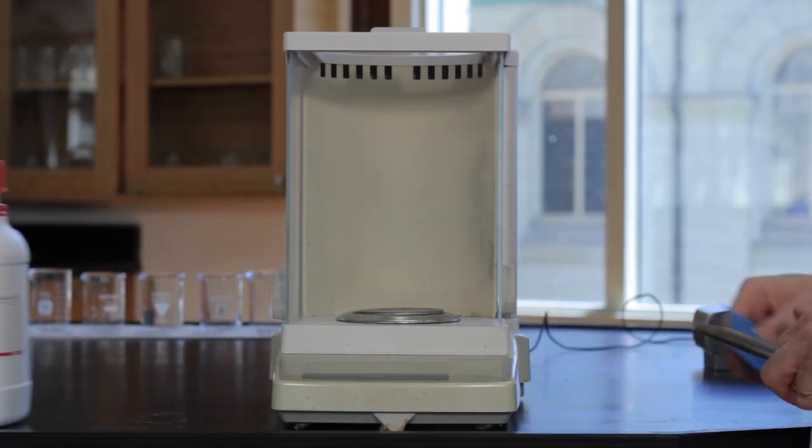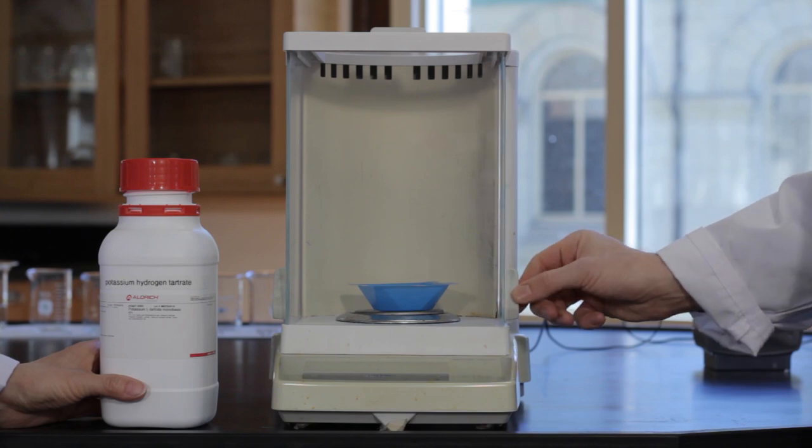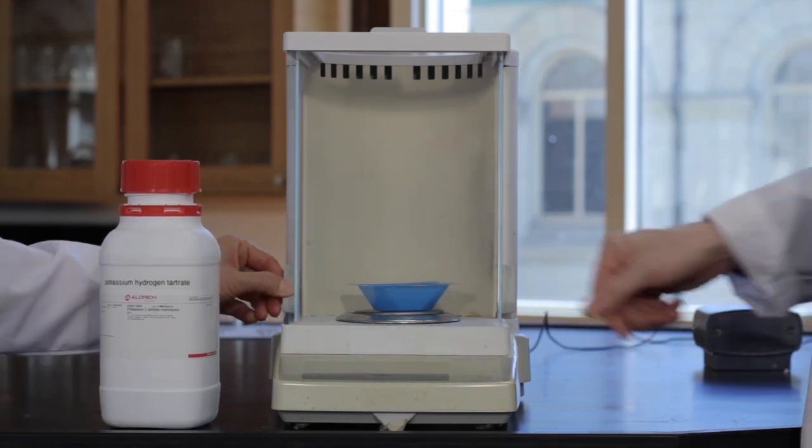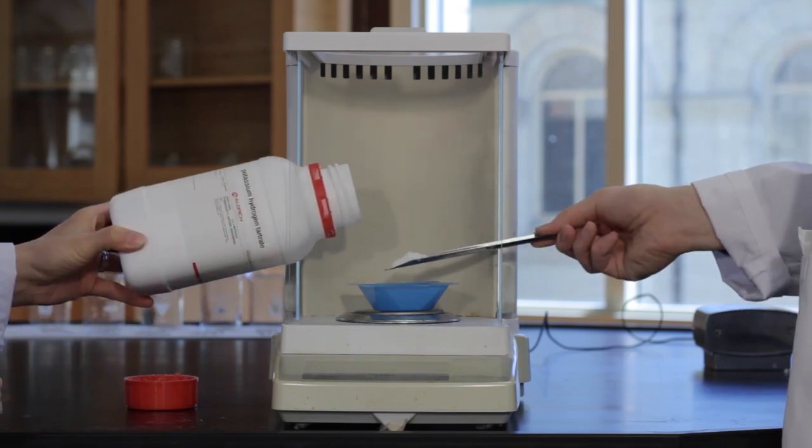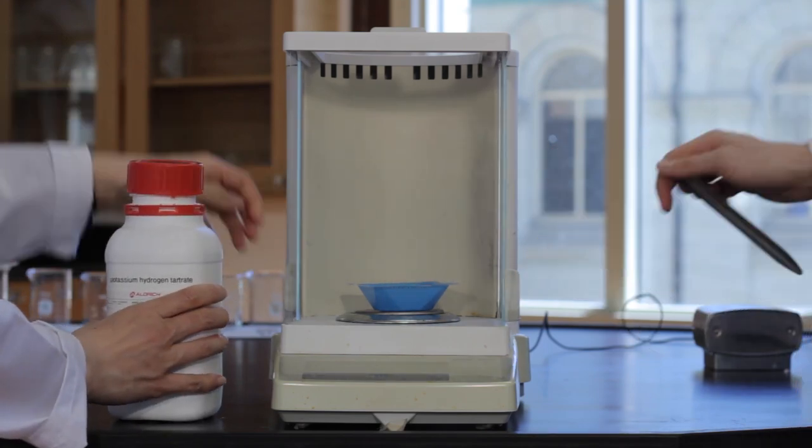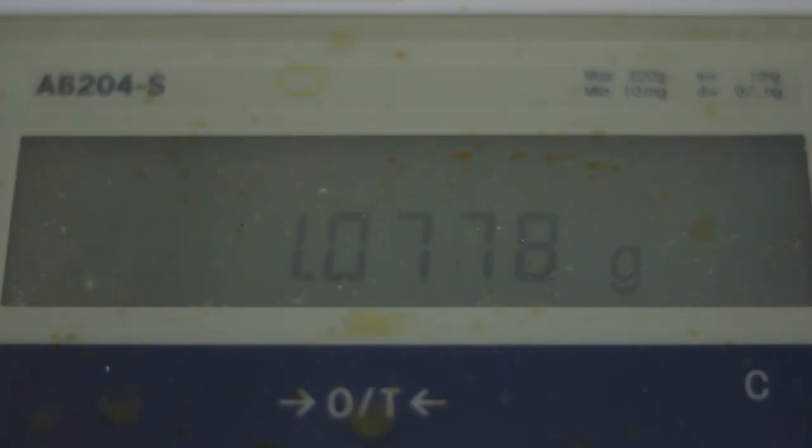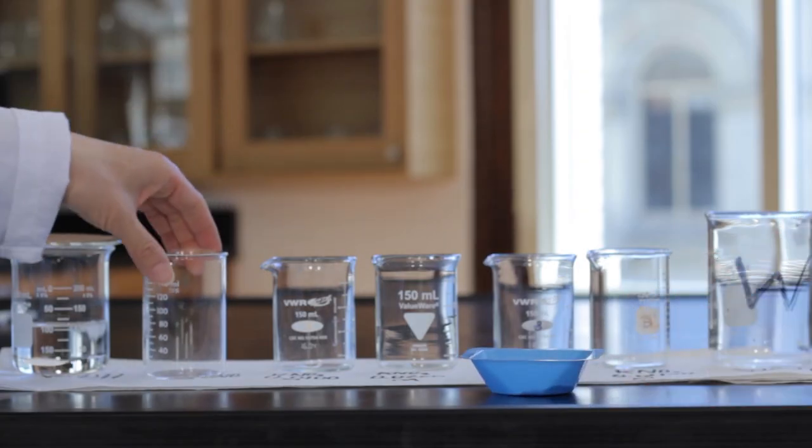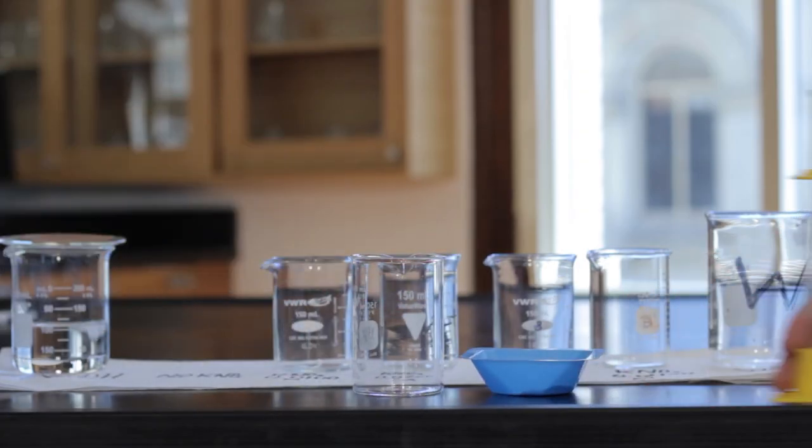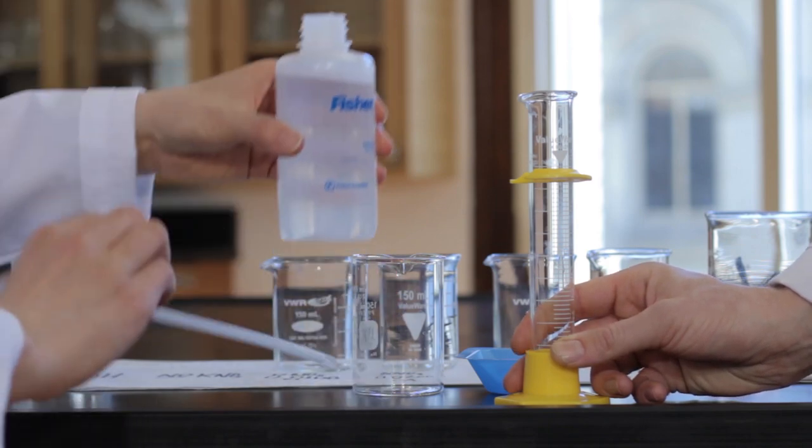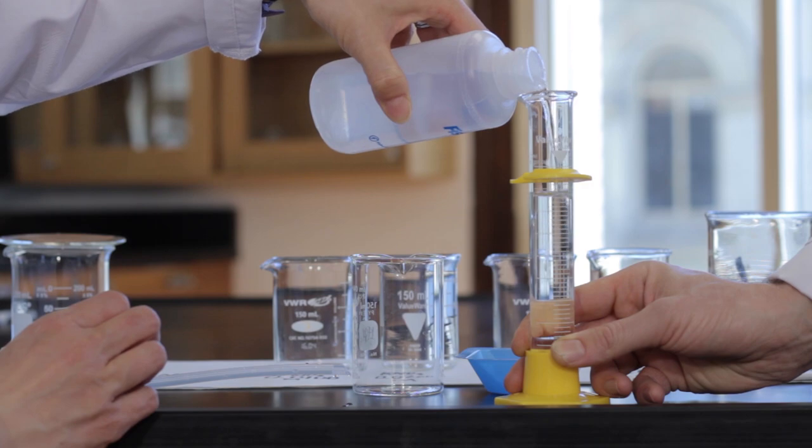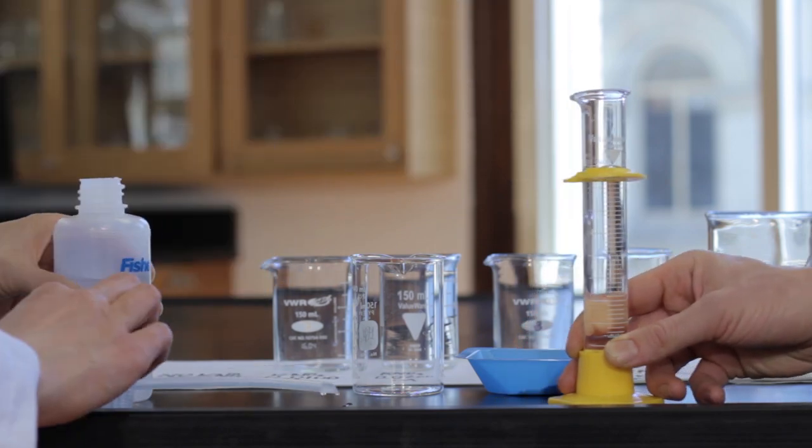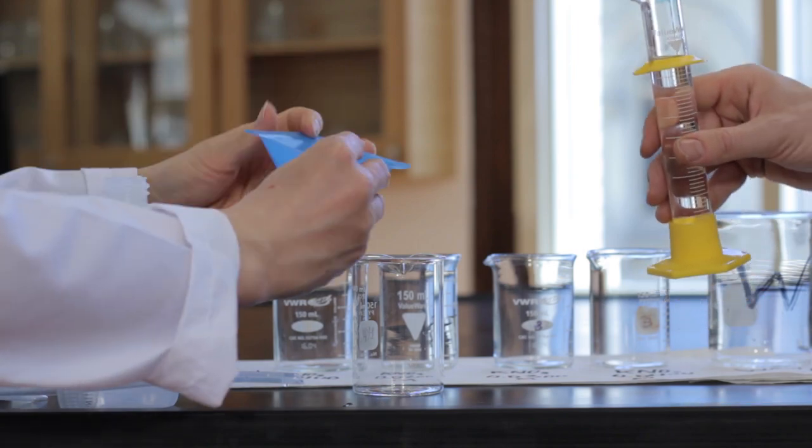Weigh out approximately 1 gram of potassium hydrogen tartrate. Transfer the solid into a clean, dry beaker.